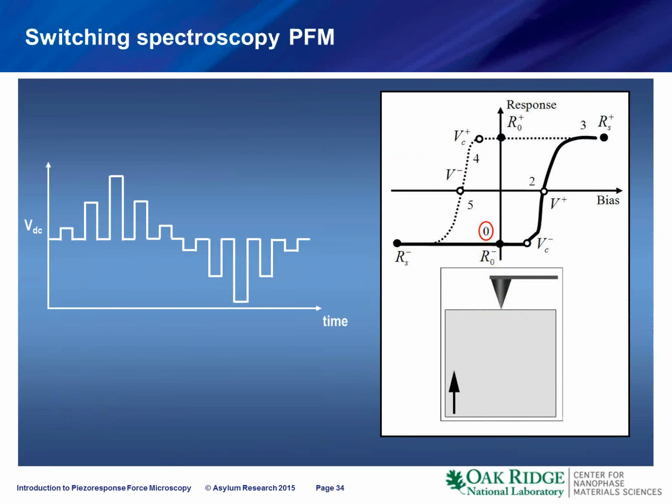In fact, we can also extend this approach to more complex methods. We'll talk about it in more detail in the next seminar. But we can take the band excitation method and combine it with the spectroscopic modes of PFM. In this case, the prototypical mode is Piezoresponse Spectroscopy. So imagine that we apply a waveform like this, this modulated triangular wave. If we apply a small bias to the sample, then nothing much happens.